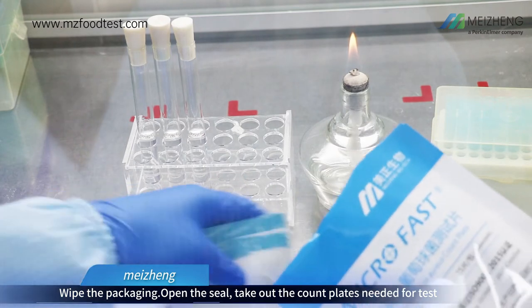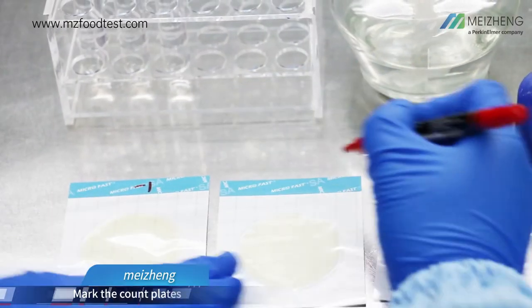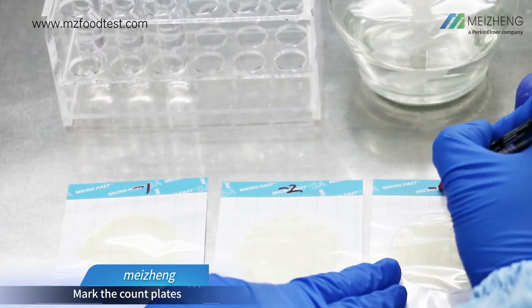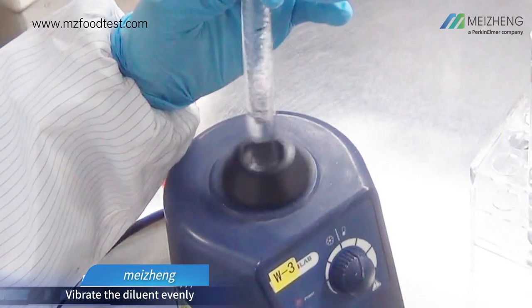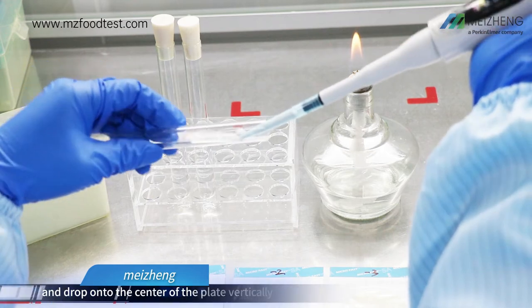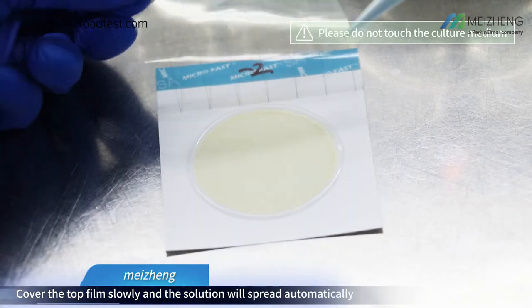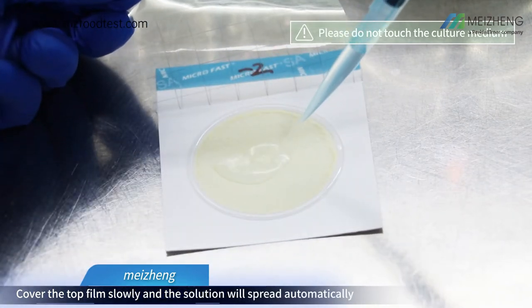Open the seal and take out the count plates needed for the test. Mark the count plates. Vibrate the diluent evenly. Pipet 1ml sample solution and drop onto the center of the plate vertically. Cover the top film slowly and the solution will spread automatically.